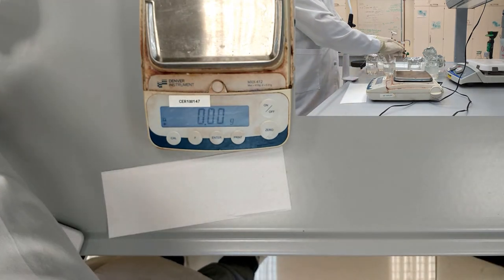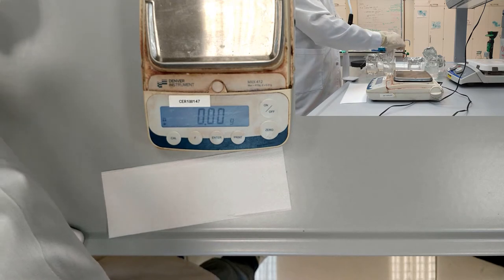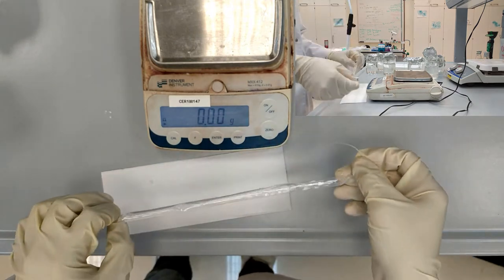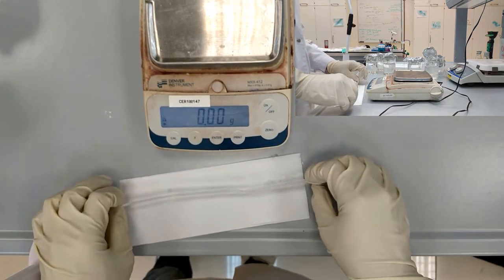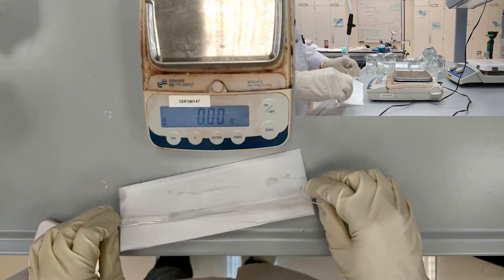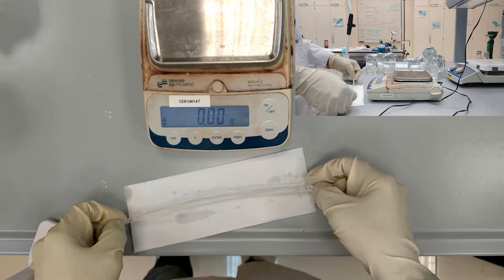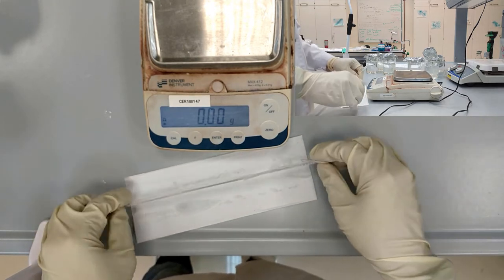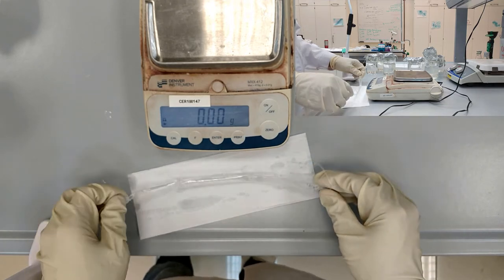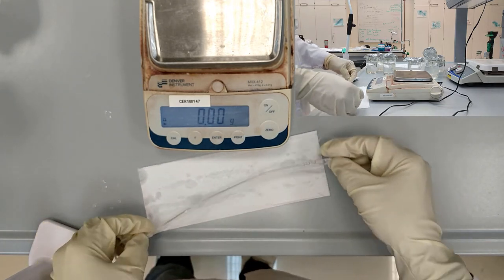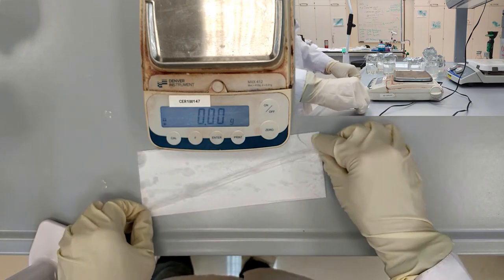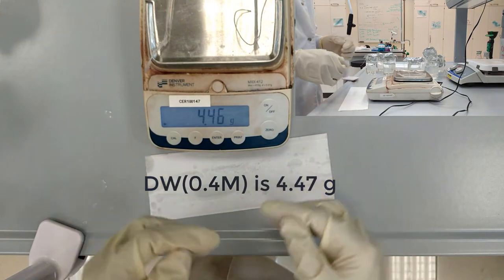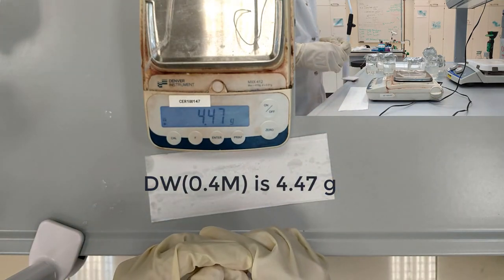Then we take the 0.4 molar concentrated glucose. After drying, we put the dialysis tube on the scales. So the mass is 4.47 grams.